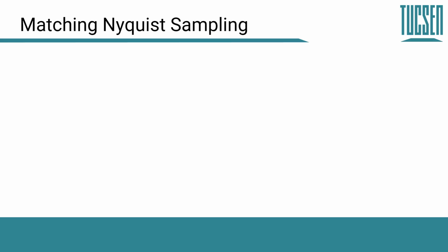So how far should we push the pixel size? As I talked about before, you can take this too small. You can take this so small that we're not actually gaining anything, because we're just seeing our blurring more accurately, which doesn't actually do us any good. The question is, are we matching Nyquist?